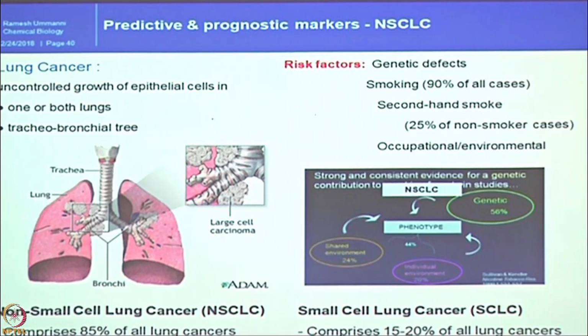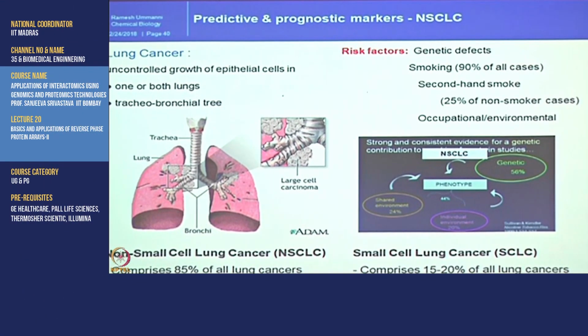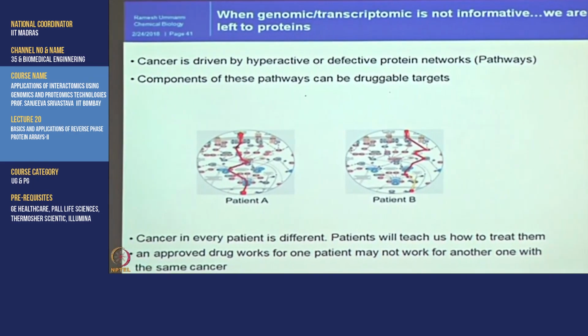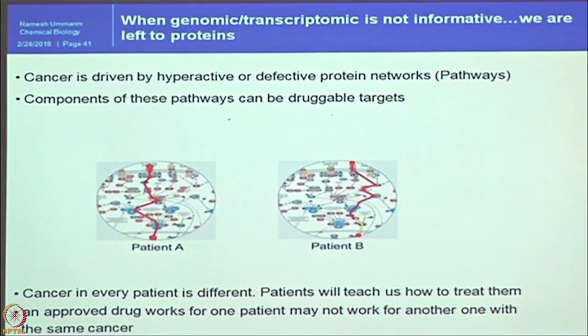Now, in the clinic, even doctors are not able to segregate them before starting the treatment. So, what kind of drug is good to give to them? Keeping that in mind, at least we try to do some good experiments on how we can separate the patients based on their molecular subtypes using the RPPA approach. I will show only one or two examples of why it is required.